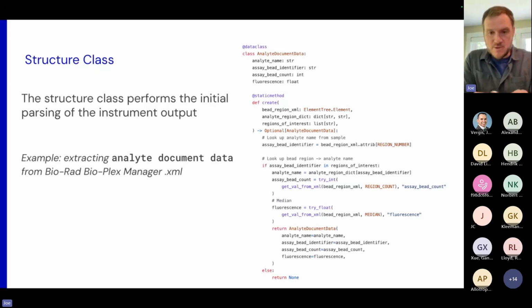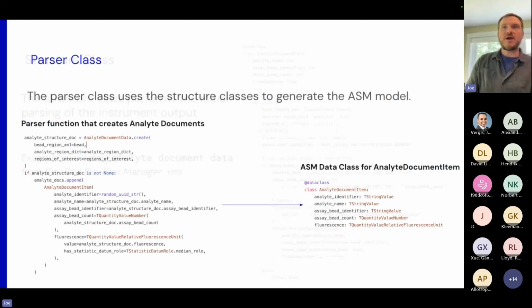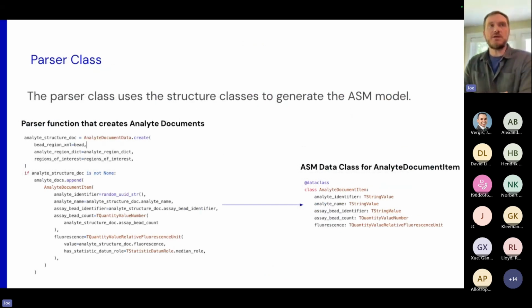Bioplex Manager is an instrument used to do xMAP assays, or multi-analyte profiling assays. The second part is that we use the parser functions to take these classes and write them directly to the structure of the ASM. This makes it easier because you're not trying to do it all at once, and it really divides the problem in half: get the data out, and then write it to ASM.